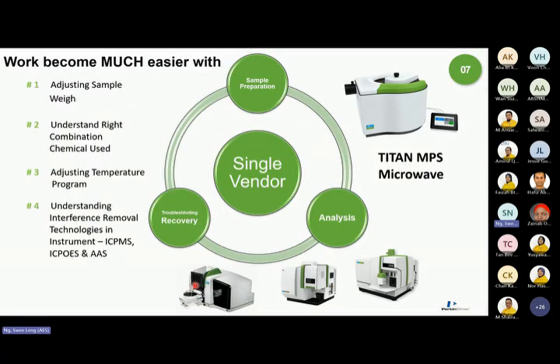So you want the supplier of the sample preparation and the equipment to be the same vendor, because your methodology consists of sample prep, or decomposition of the sample, followed by analysis. The method is divided into two parts: one is preparation, the other is the analysis part on the equipment. If you are under the same window, troubleshooting is actually much easier.